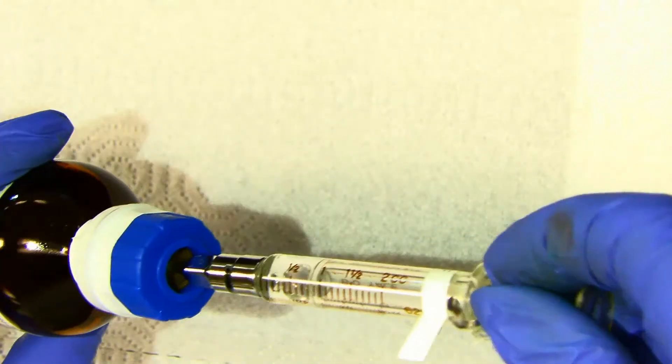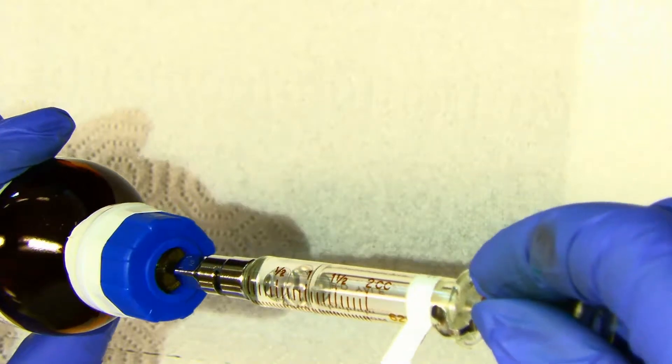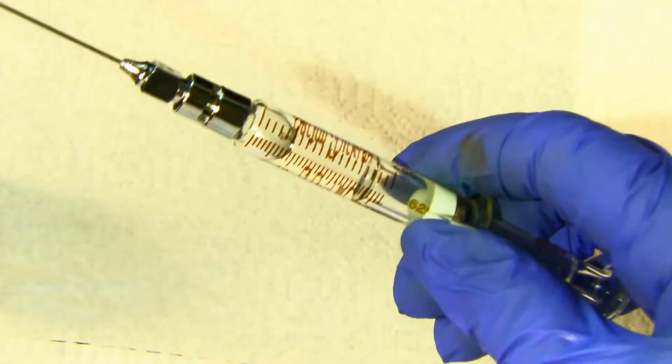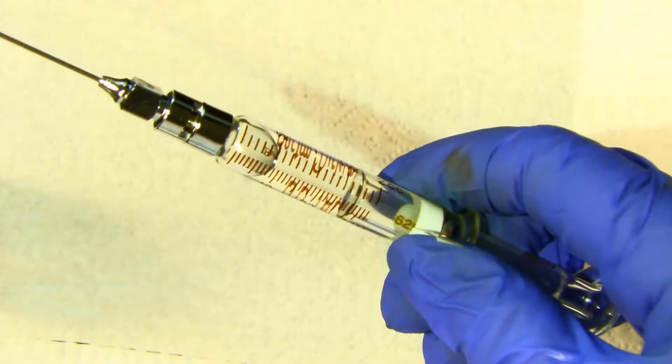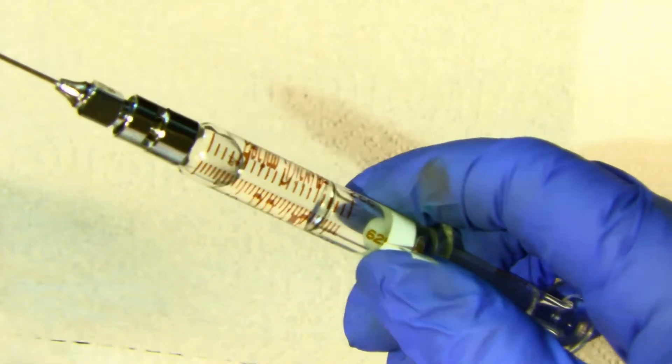You may see that there's an air bubble in there now. We will get rid of the air bubble. Now we tilt it upward, and you can see the bubble has gone to the top.